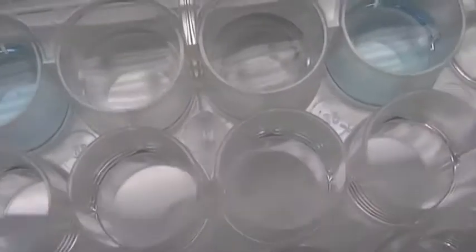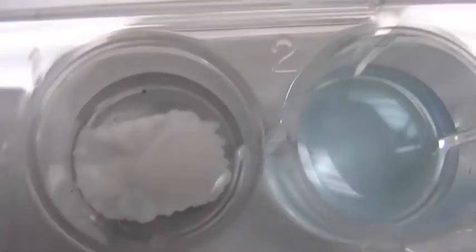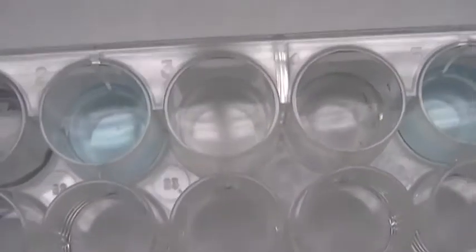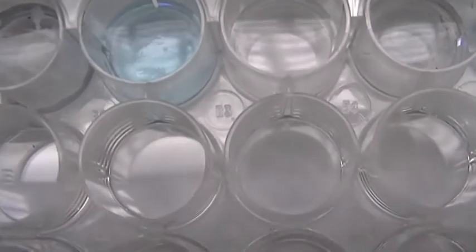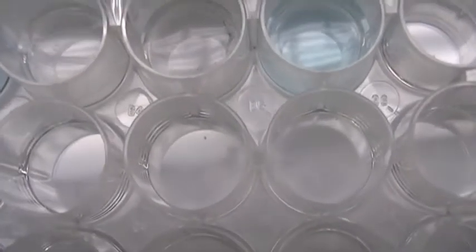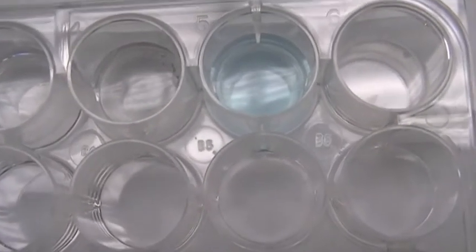Hopefully this shows up. I'm not sure if you can see that white precipitate that has formed, but you have a white precipitate now inside of there. That is the observation you're going to have for that. And when we put 1 drop of HCl into the copper solution, nothing visibly noticeable. And to the zinc nitrate, again, nothing noticeable.